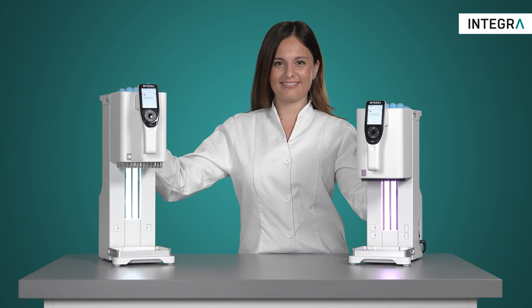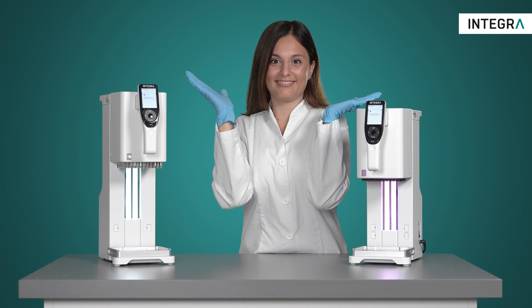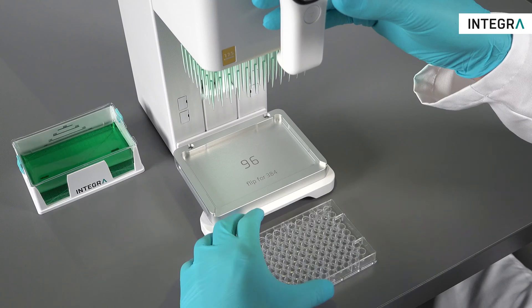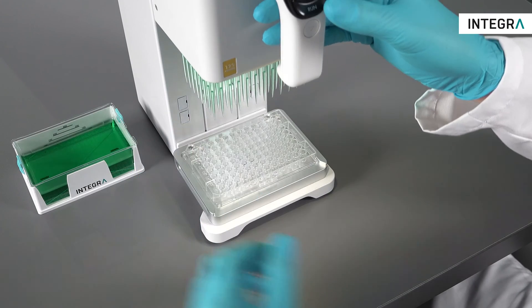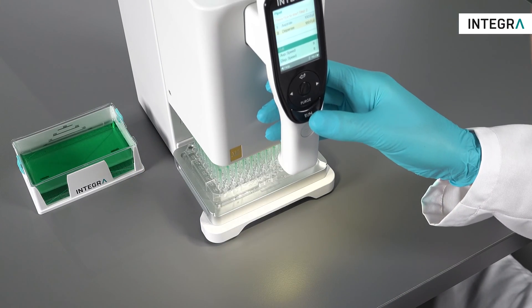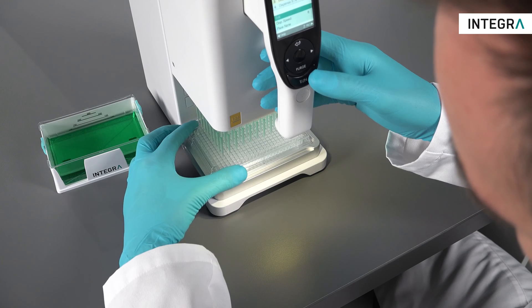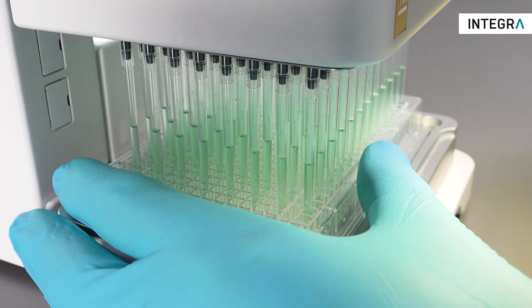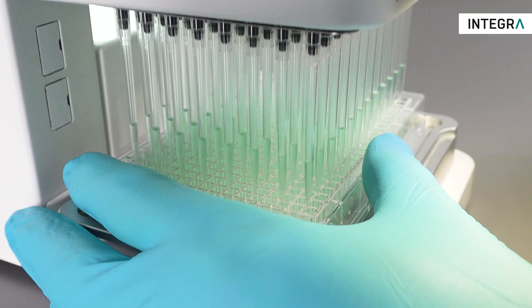So what is it that the MINI 96 can actually do? Here are some of the things that it's great at: reservoir to plate transfers into both 96 and 384 well plates. 384 well plates can be filled by dispensing 4 times into them with the 96 channel head.